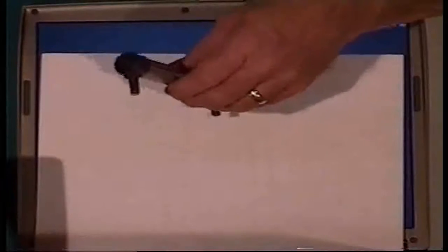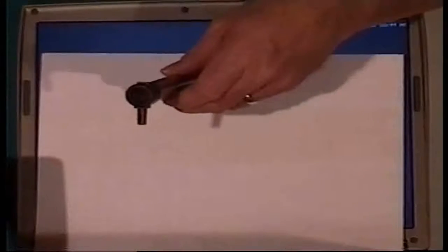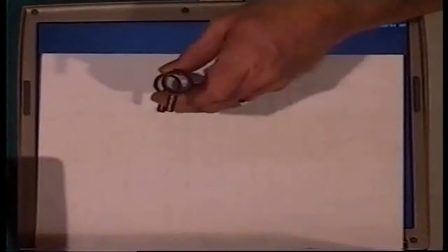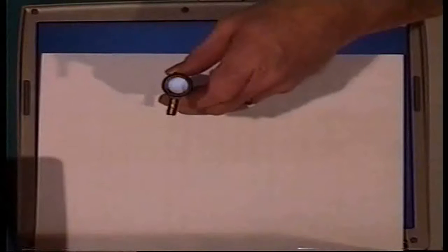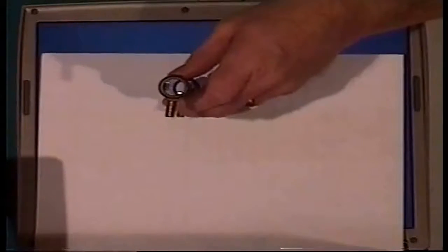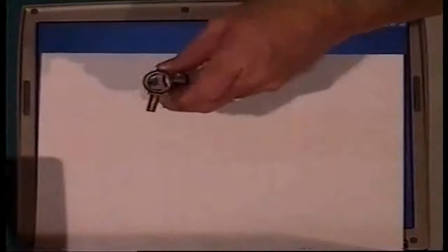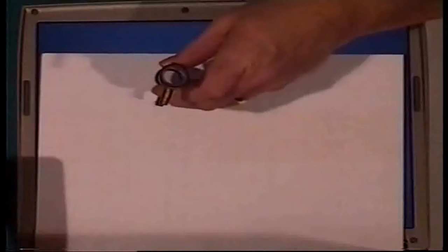So if you have a corrosive gas, or if you have moisture, or if you have contaminants or particulates, the sample chamber completely isolates this from the detectors and from the IR sources. So this is where you're getting your rugged reliability. Should you get contamination into this sample chamber, you can take it apart. These end caps unscrew. You can clean the sapphire windows, and you can have it up and running again probably within half an hour.